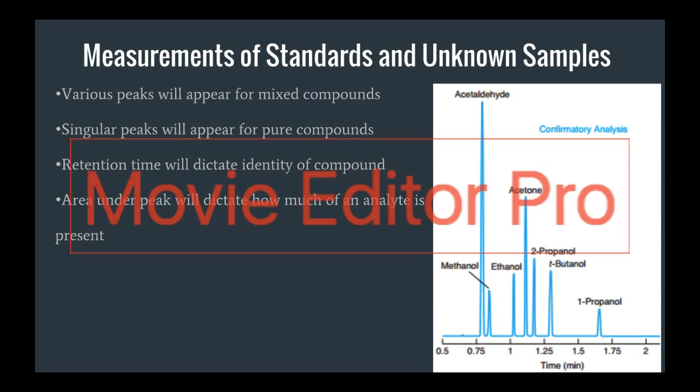The final stage of GC is the measurement of standards and unknown samples. After the sample is injected into a stream of an inert gas, usually helium, that acts as a carrier, the gas stream moves at velocities that are influenced by the degree of interaction of each component with the stationary non-volatile phase. Substances having greater interaction with the stationary phase separate from those with smaller interaction.